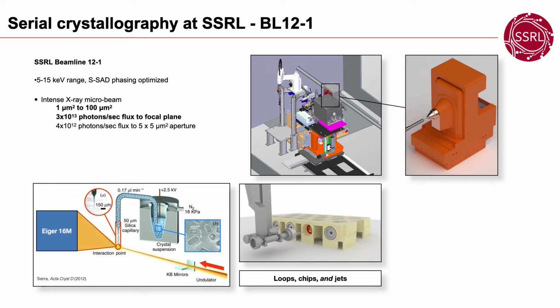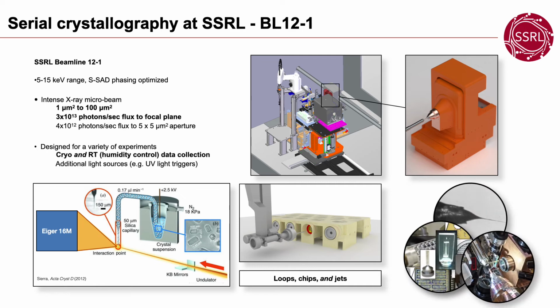The instrument has been set up for conventional and serial crystallography involving any device, loop, chip, or jet, and designed for a variety of experiments at cryo or ambient temperatures with full humidity control, as well as compatible with a variety of additional light sources such as UV light triggers that I mentioned before.